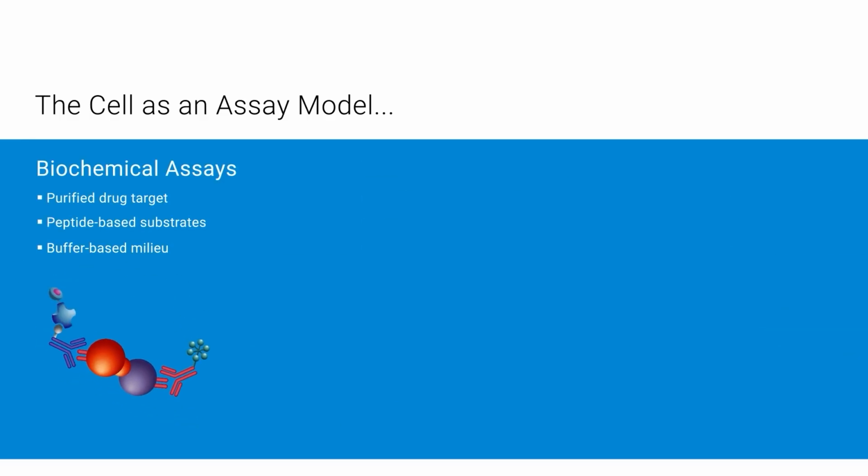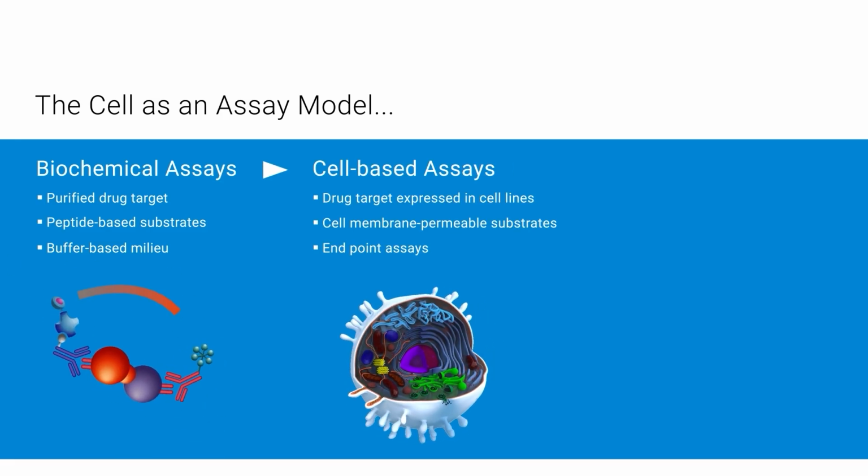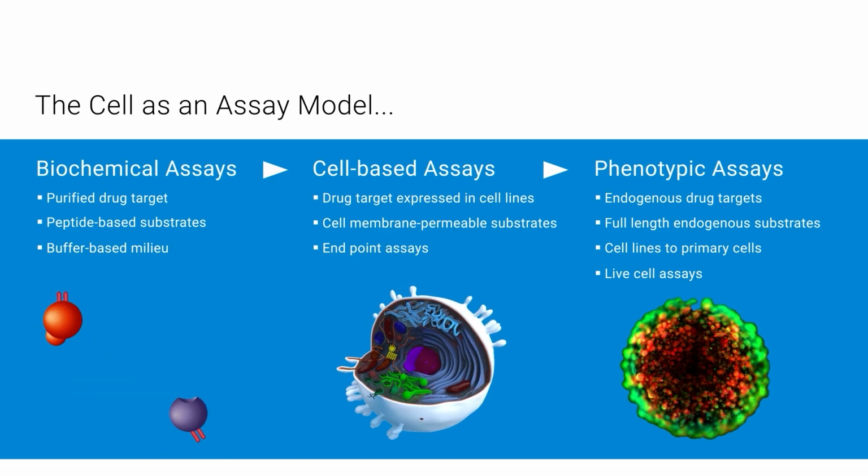In this virtual demo video, I'm going to be talking to you about Agilent BioTek's Gen5 microplate and imaging software. Gen5 is a powerful and versatile software package that drives data and image acquisition, processing, and analysis for BioTek's readers and imagers. To help illustrate the power and flexibility of Gen5, when we think of how research proceeds, we can envision an inverted pyramid. You start broad and work towards more specific and detailed answers.